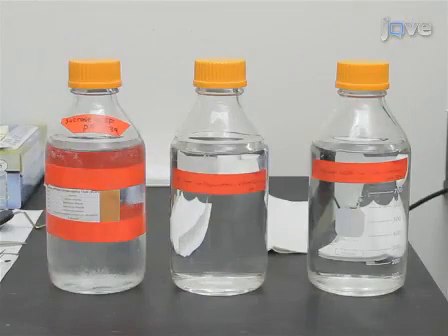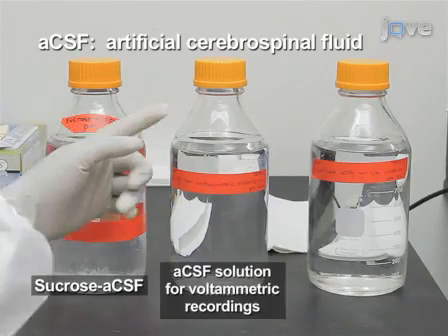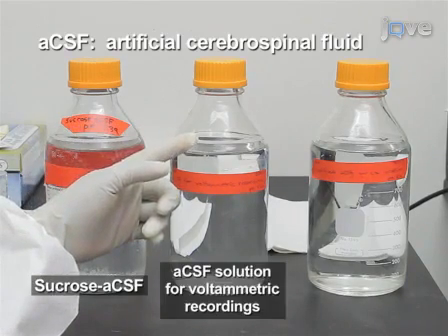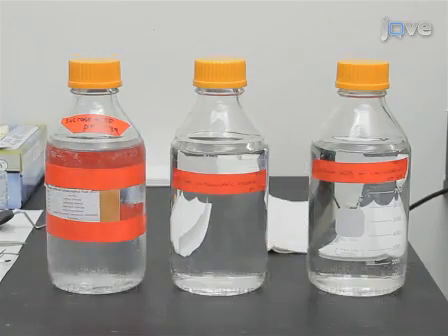To begin this procedure, according to the accompanying manuscript, prepare 3 types of artificial cerebrospinal fluid solutions: sucrose ACSF, ACSF solution for voltammetric recordings, and modified ACSF solution for electrode calibration.